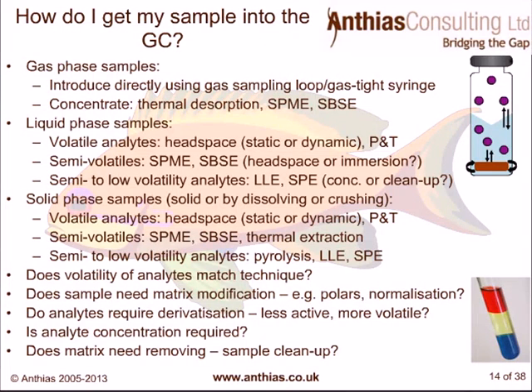Semi-volatile, so you could be again using SPME, SBSE, and again, think about, do you do headspace or immersion? Do you put your SPME fibre in the headspace above your sample, or actually put it directly into the liquid? And if you're looking at semi to low volatility analytes, things like liquid-liquid extraction, solid phase extraction, and again, are you using those for concentration, or for cleanup, or for both?